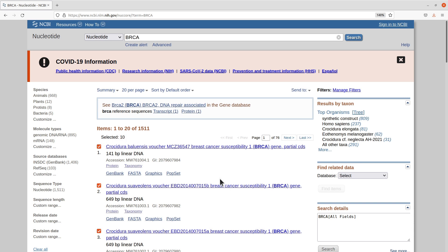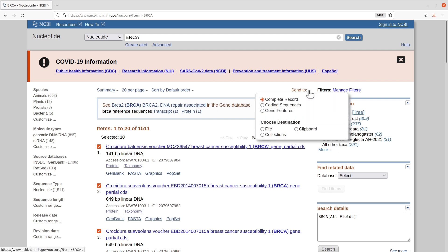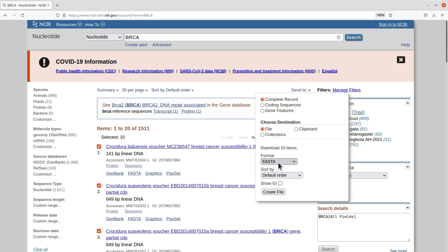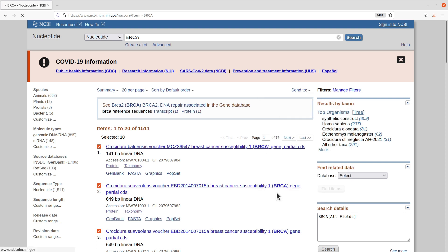I will now go and download it. On this same page, follow my cursor to the right here and you see this button called Send To. I'll just click on it. Make sure complete record is checked, and then come to file. And then here we have formats. We select FASTA. So complete record to destination file format FASTA, and then I'll click on create file.